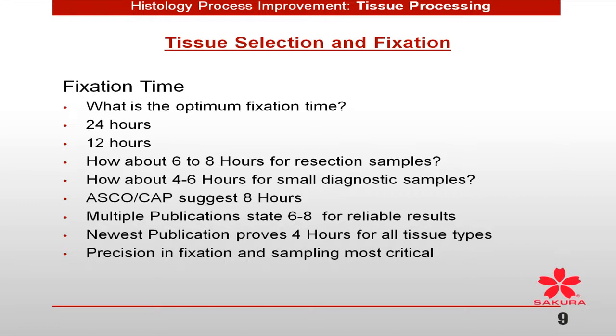I'm sorry we spent a lot of time on tissue fixation, but it is most critical. I mean, if you went through a histotechnology school, if you've been in histotechnology for years, if you've learned anything off the internet, everybody tells you if you don't start correctly, you can't finish correctly. And most often, I find we'll all go out and buy a variety of expensive instruments, but then we don't even spend the time to get back to the basics.